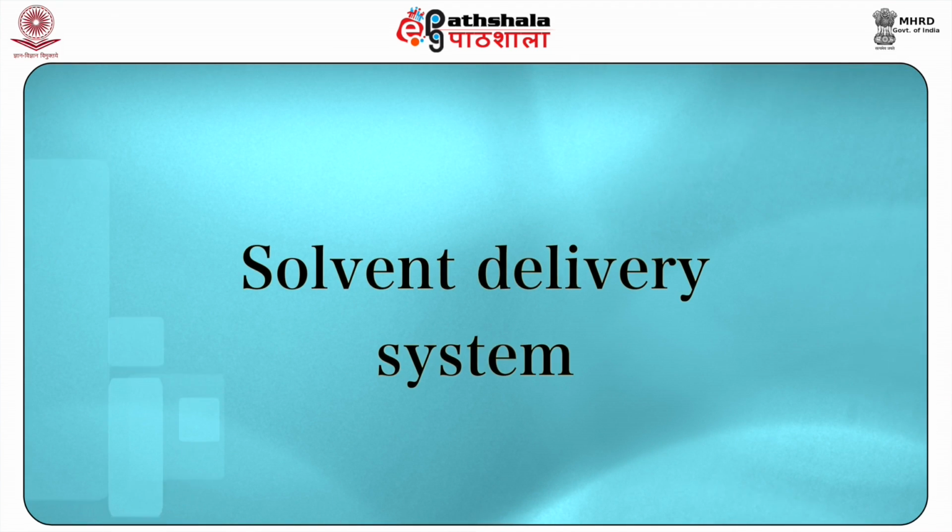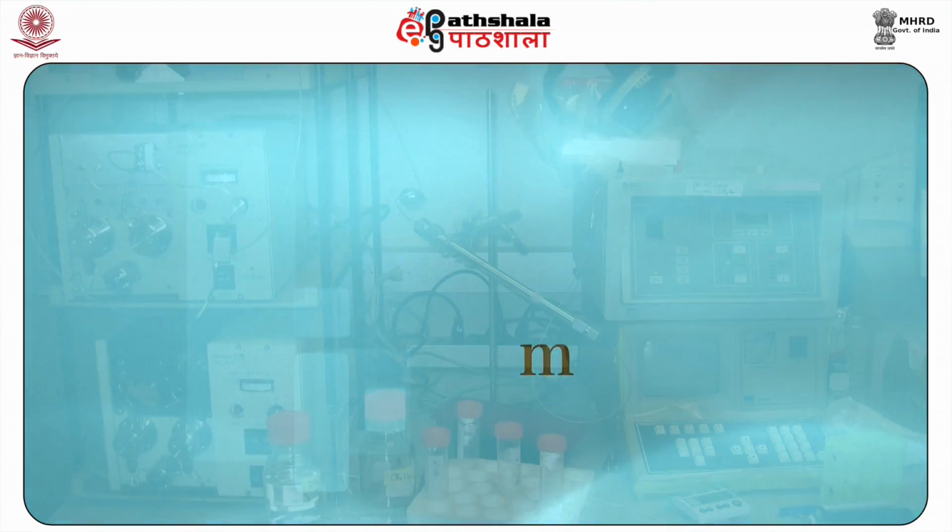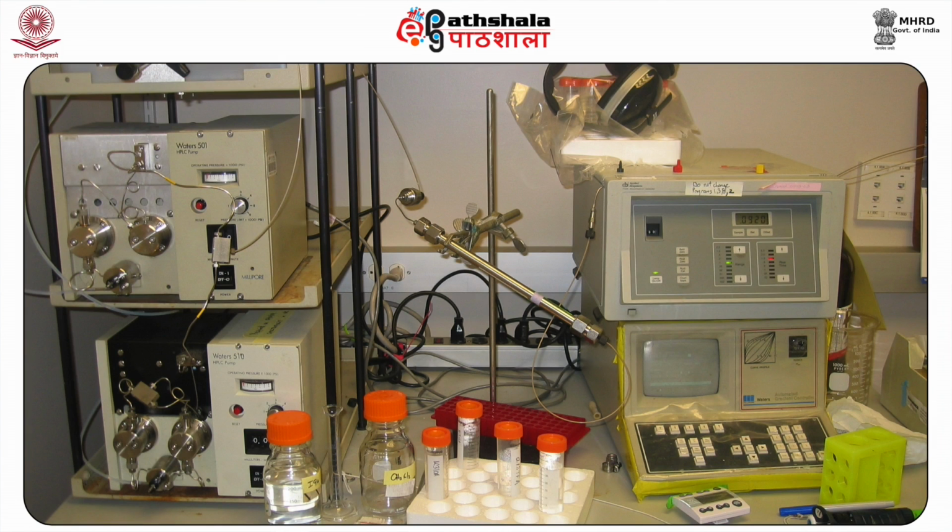Next is solvent delivery system. High pressure pumps are generally used to move solvents by force through the packed stationary phase beds. Flow rate stability is an important pump feature. An added feature found on the more elaborate pumps is external electronic control. Although it adds to the expense of the pump, external electronic control is a very desirable feature when automation or electronically controlled gradients are to be run.